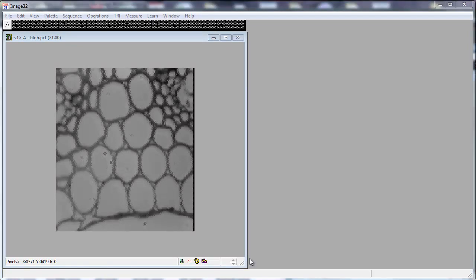The final element of the image window is the display translation control. This is located in the bottom right hand corner of the image. At the moment you'll see that this is effectively greyed out. This is because the image is an 8-bit image. However, if the image contains 16 or 32-bit data, you would see additional information present.